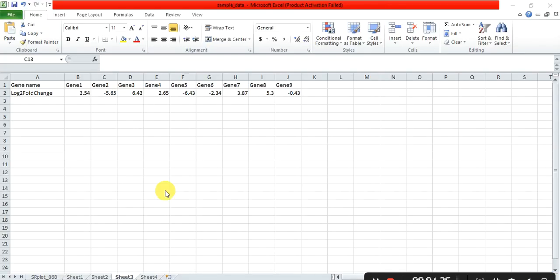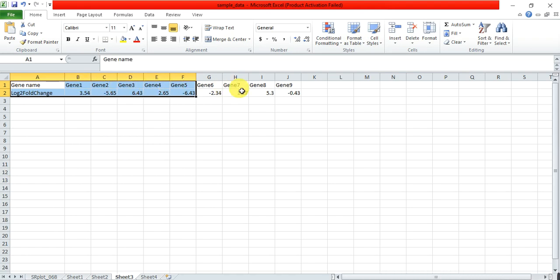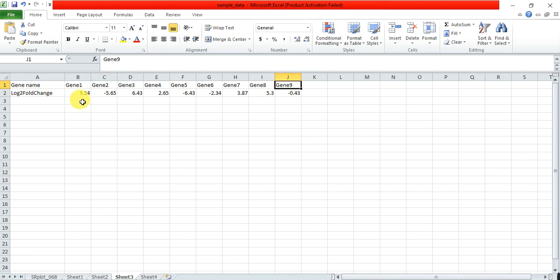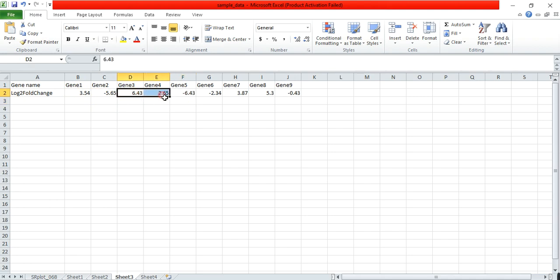For example, we have the data like this is my gene names: gene 1, gene 2, 3, 4, 5 up to 9, and there are their log2fold change values. This expression data of gene 1 is 3.54 and this is minus 5.65, 6.43, 2.63, and this is a minus, meaning this has the negative and these have the positive log2fold values.